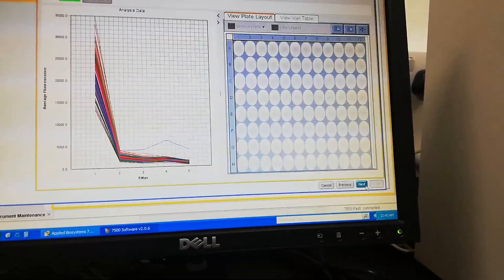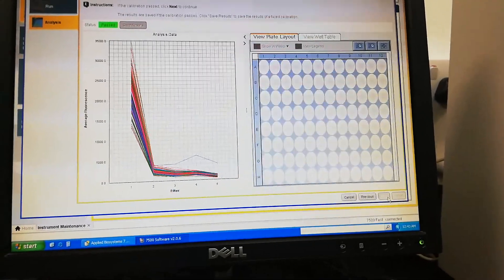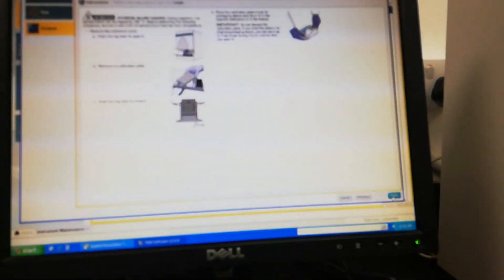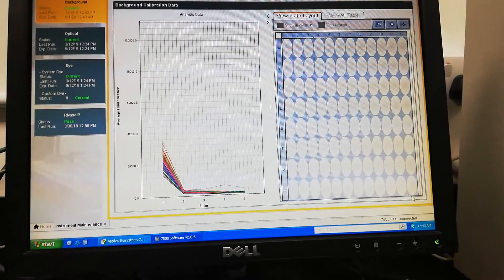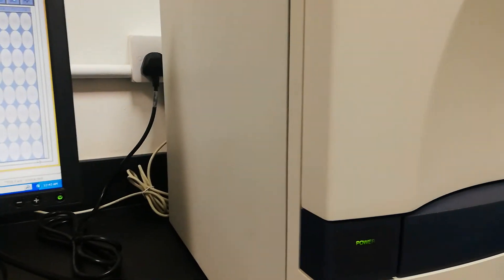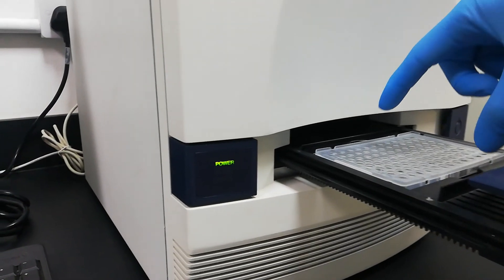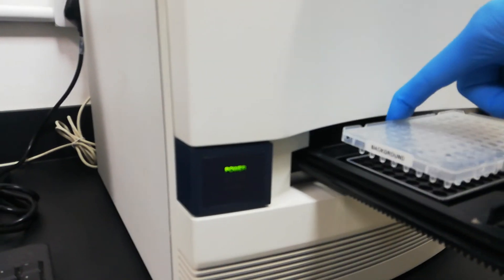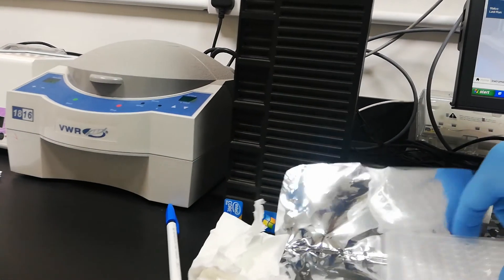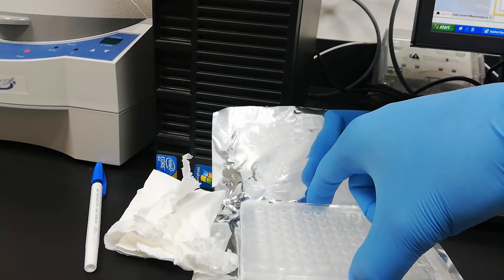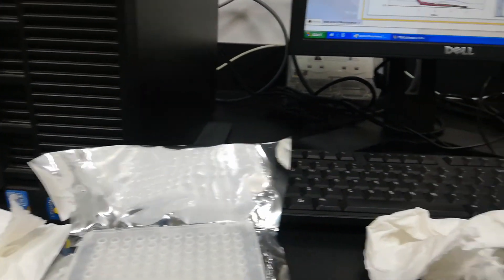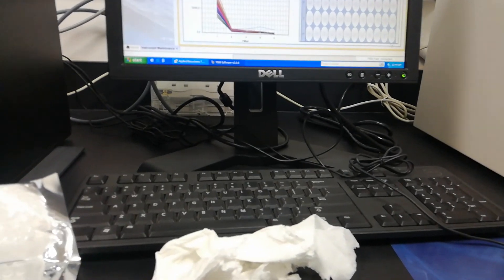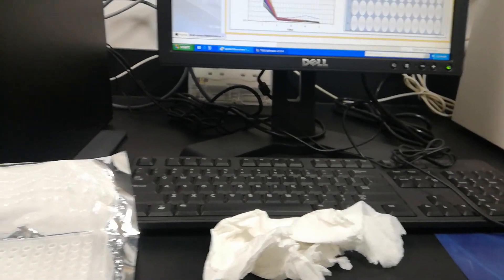We just have to take out the plate from the machine. This is all done. Take out the plate and always put the plate on its cover. Do not put this calibration plate anywhere else.